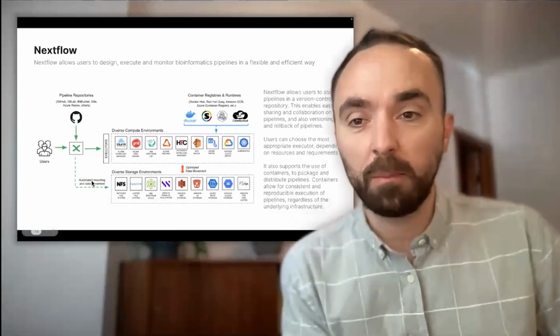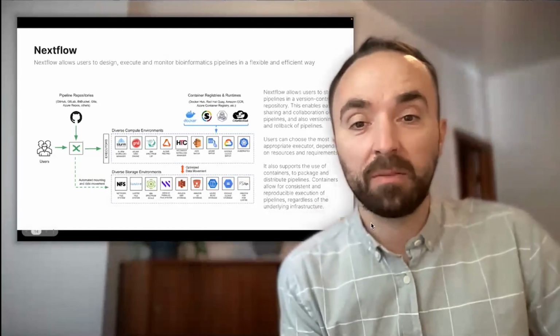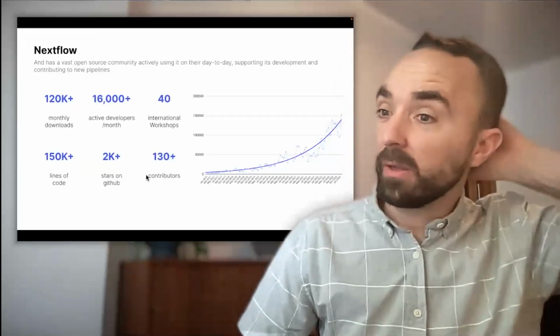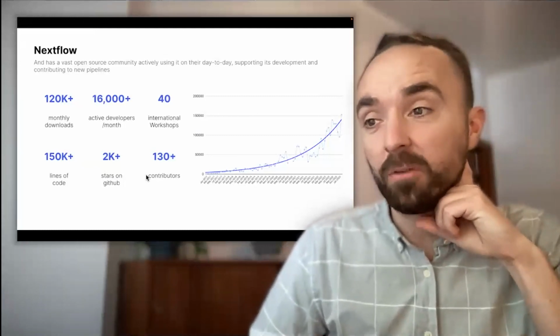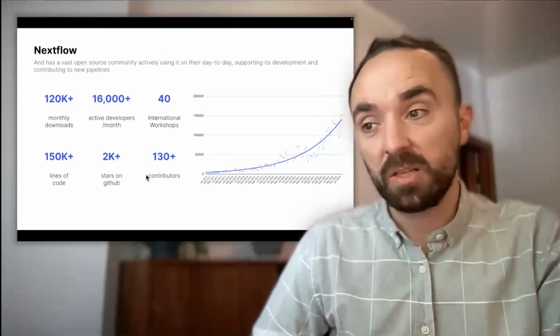And Nextflow is an important part of this because it provides that portability. It can run on any of these diverse computing environments shown in the figure. Nextflow itself has been growing extremely rapidly. This growth is strongly driven by the community, particularly the NF Core community. Obviously, we at Seqera have a strong interest in supporting and encouraging this effort.